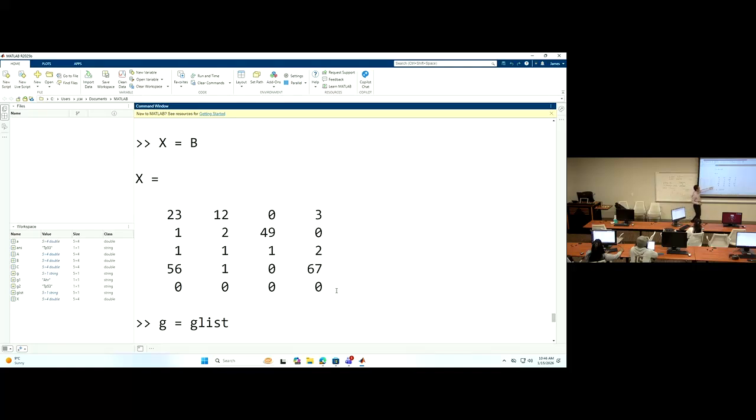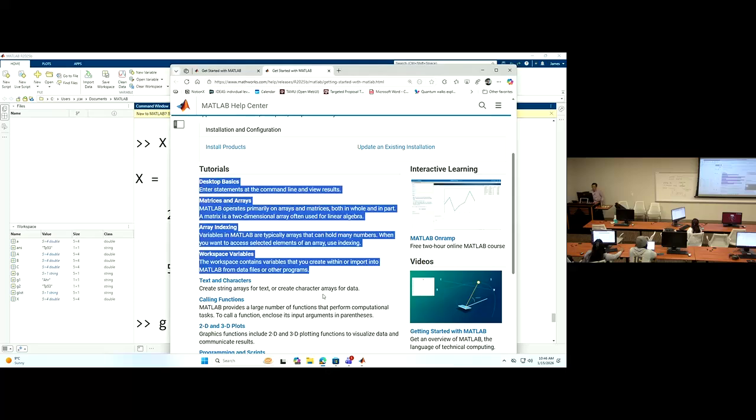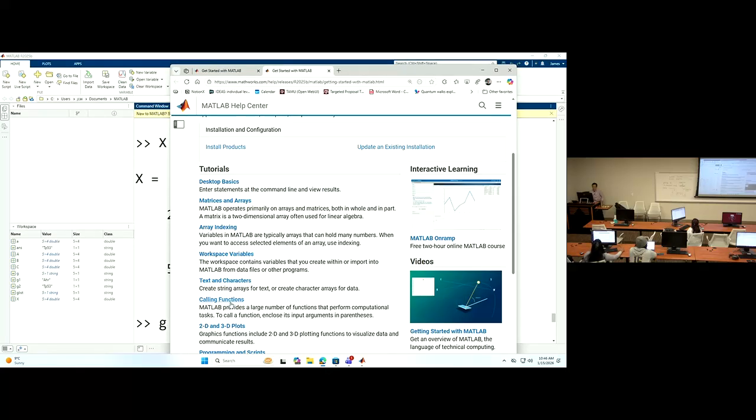This big X will pretty much look like this. There are a lot of zeros, sparse, and some cells express this gene at a low level, and suddenly there's a cell that expresses this gene at a really high level. So this is what you will see in the real data. So that's this part, and calling a function.